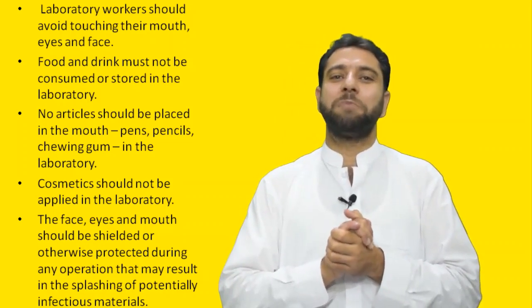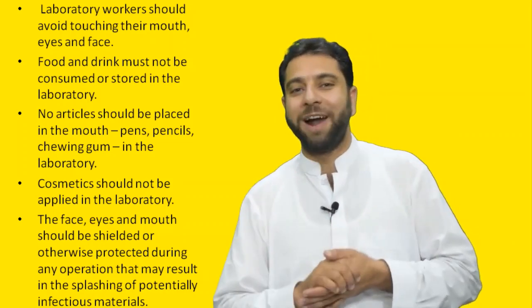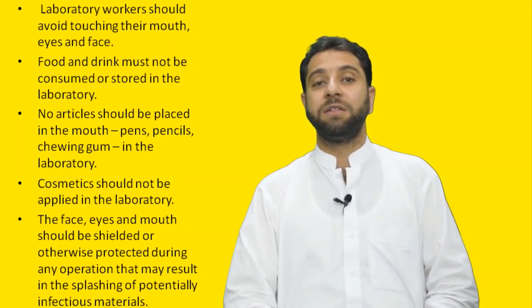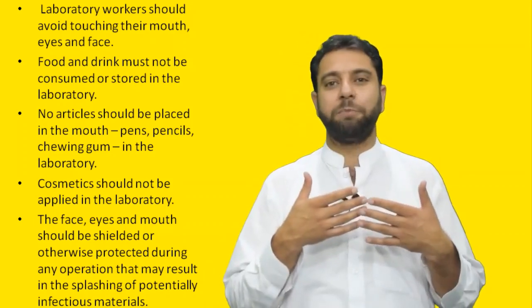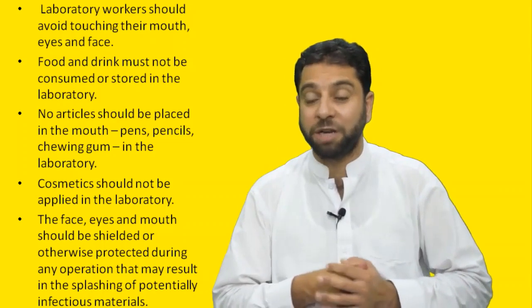Proper personal protective equipment should be used to avoid ingestion of infectious materials and to avoid contact of infectious material with skin and eyes. Like the face, eyes and mouth should be shielded or protected during any operation that may result in the splashing of potentially infectious materials.